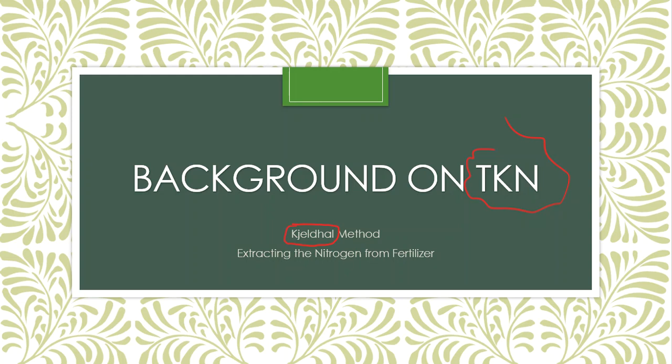So the Kjeldahl method is very specific because a lot of the tests that we're doing in this course, called advanced lab methods, introduce various pieces of glassware that you maybe have not seen before, or processes that you don't get a chance to do in a regular science laboratory-based course. And this is one of those. So the Kjeldahl has made its home many, many years ago. And that home had a very good foundation, and that home is still standing today.